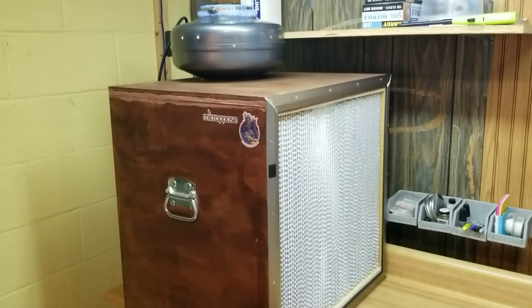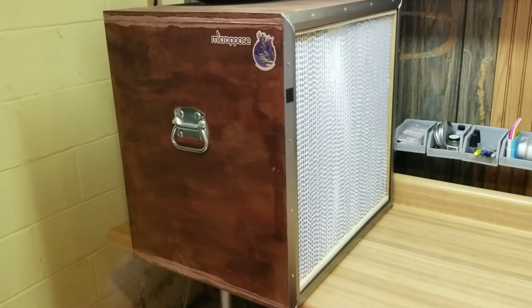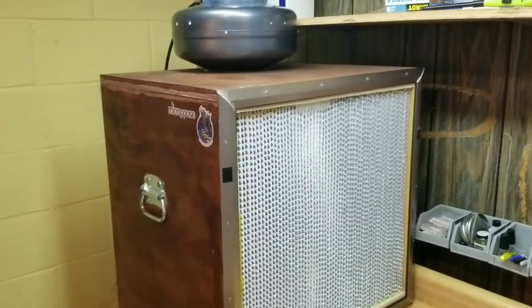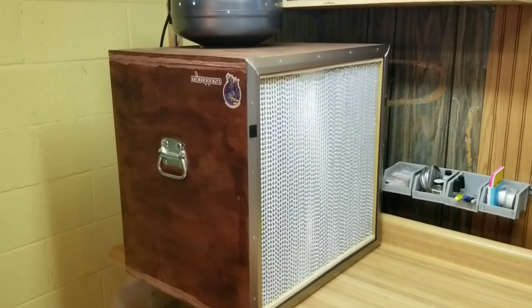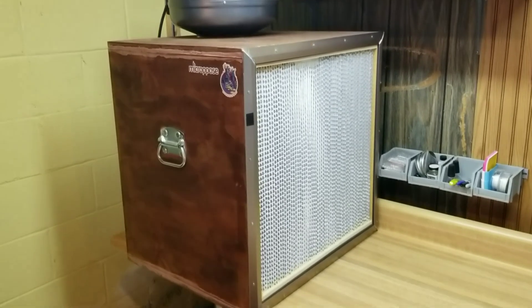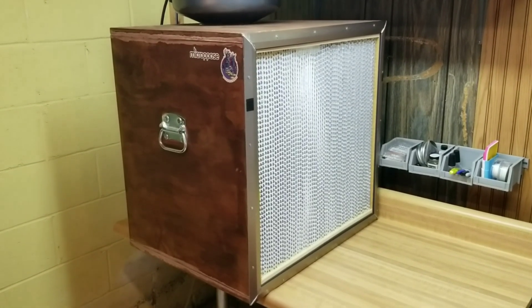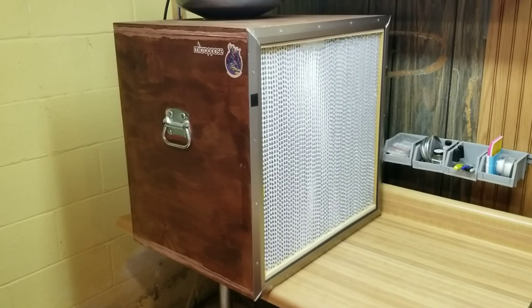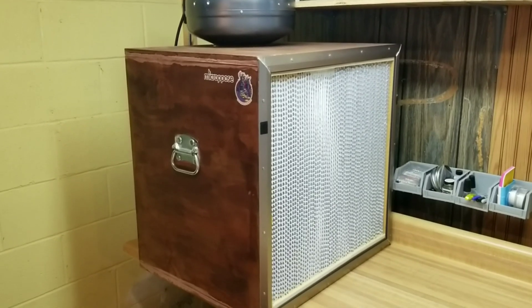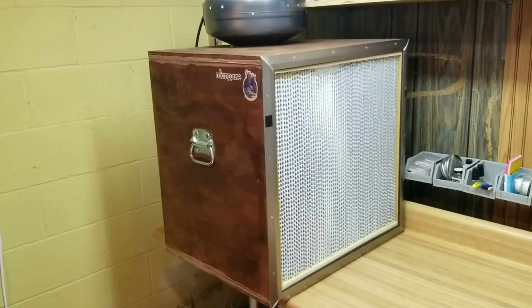This has been much requested by you guys, so I'm going to go ahead and do it. It doesn't seem very exciting to me, but I guess you guys want to see some more details on my flow hood. So I'll give you a little background first. This was my first generation flow hood. When I first started trying to cultivate mushrooms, I tried the glove box for a little while, and I just felt cramped and didn't like the lack of freedom of movement. I was like, I just got to build a flow hood. I'm not like crazy handy — I can build a shed, but I can't build a house. So I'm handy enough to be dangerous. This is probably like 17 years I've been rocking this thing.